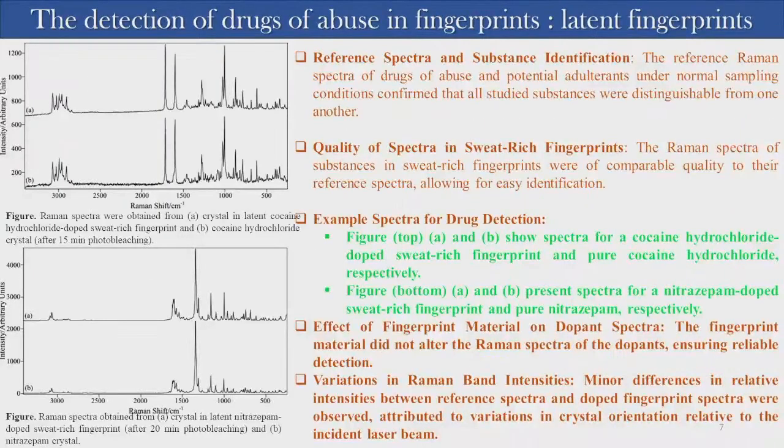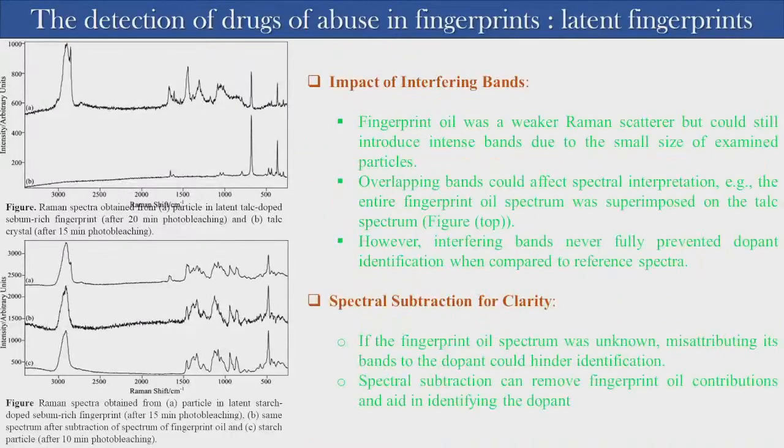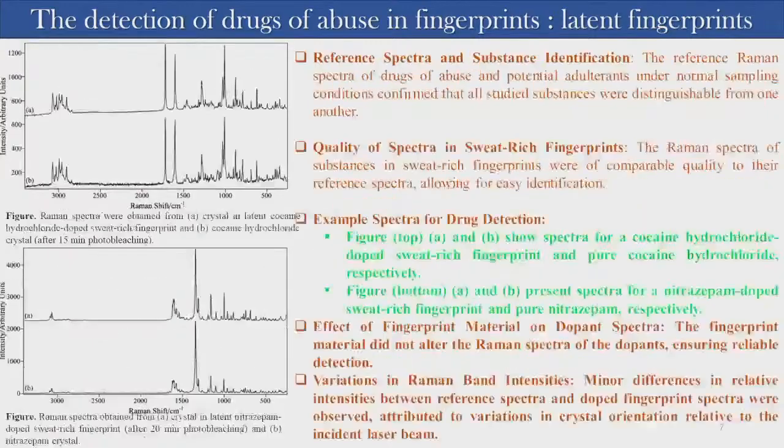So now this spectrum, A and B, shows the crystals, and this is the cocaine analysis.